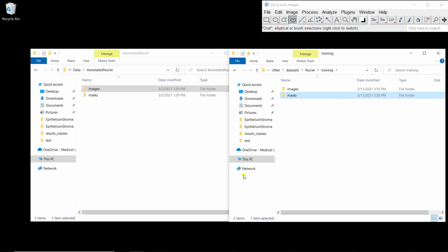And the goal now is to convert the images we have here for the annotation, where we have a different intensity for each individual nucleus, to images where we will have 3 different classes: one for background, one for inner nuclei, and one for nuclei contours. And that's something I can do with a pre-processing notebook.